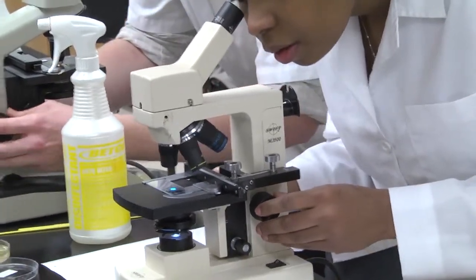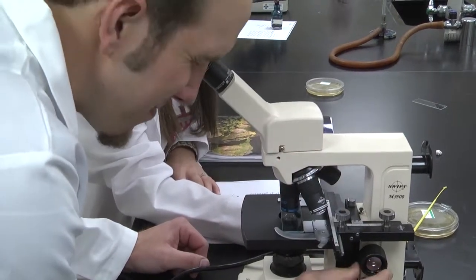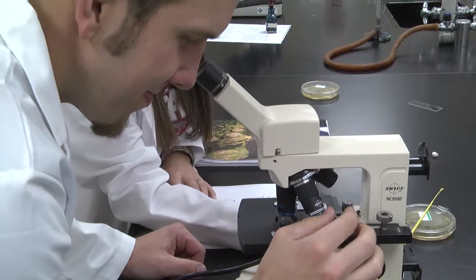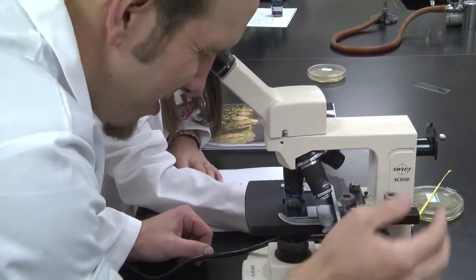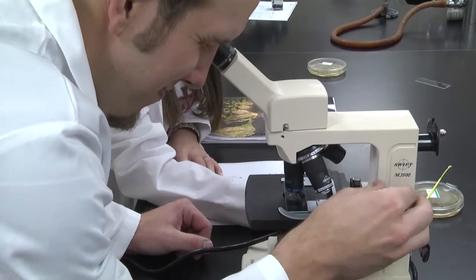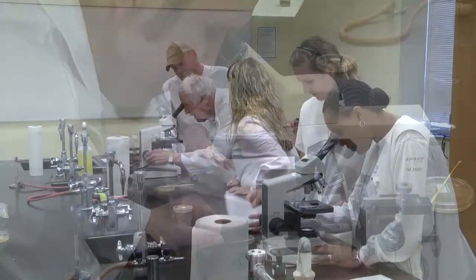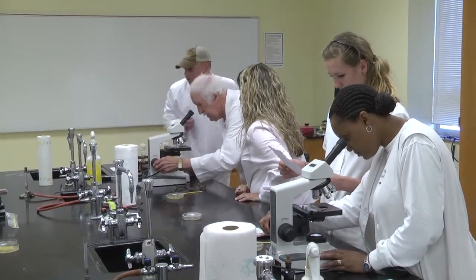This is something that you can do with an inexpensive microscope and quickly determine the shape and the arrangement of the bacteria. India ink works real well with this. We use nigrosin, but they're acidic stains. With the other stains, we use a basic stain. So with a capsule stain, we'd carry this a little bit further, but it's still a very simple procedure.